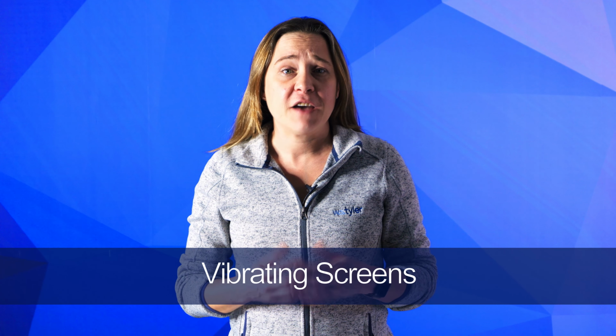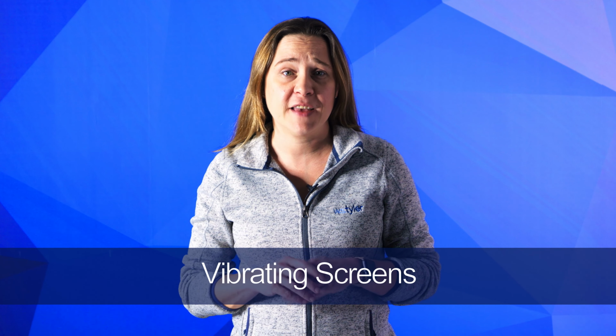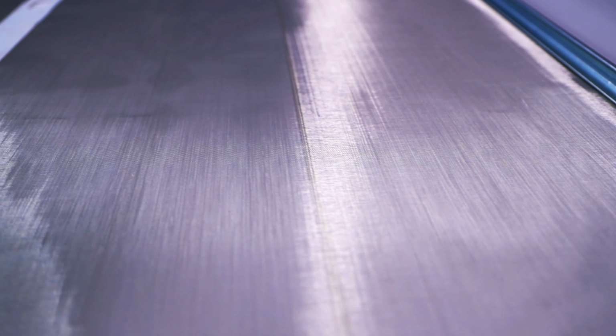Vibrating Screens carry out a similar version of particle analysis as sieve shakers, but on a much larger scale. They allow for a particle separation range of 6 mesh to 325 mesh and employ one or multiple screen sections that separate particles in the same way as a test sieve stack. It uses high-frequency vibrations to promote particle movement and reduce blinding, which enables enhanced productivity.